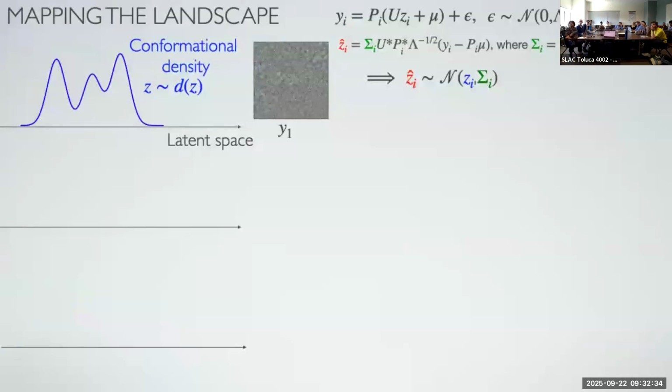Okay. So really, the issue here is that the images are very noisy, and as a result, the embedding is very noisy. And there's not much we can do about this short of somehow finding a much better microscope. But what we can do is try to at least model the effect of the noise on the embedding. And so that's what I'm going to do now.